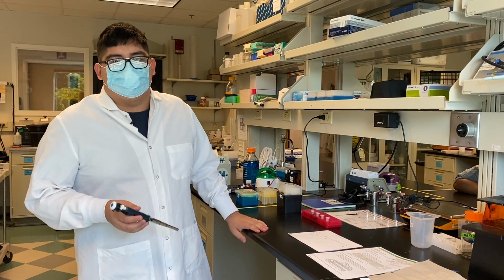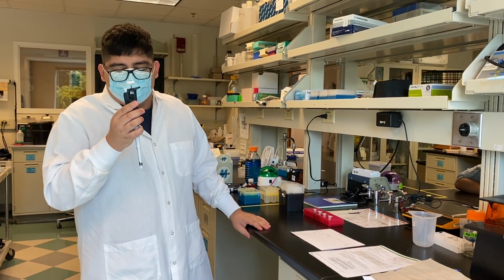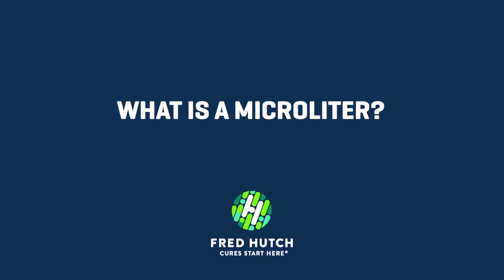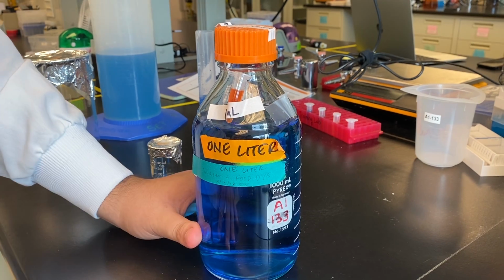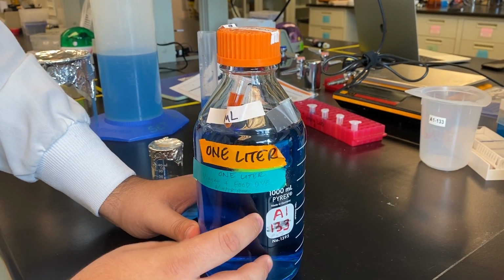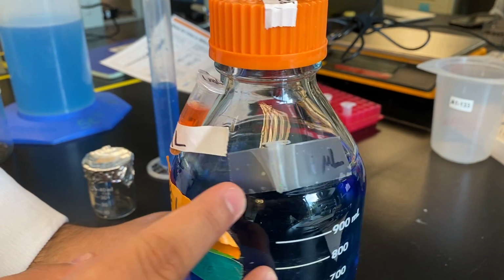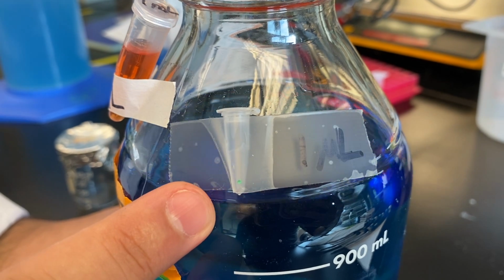Hi everyone, today we'll be learning how to use a micropipette, which is an instrument used in the lab to move different volumes when doing experiments. In science, you use different types of volumes. For example, this is 1 liter, in which there's 1,000 milliliters, in which there's 1,000 microliters, which is the most common form of volume used in science.